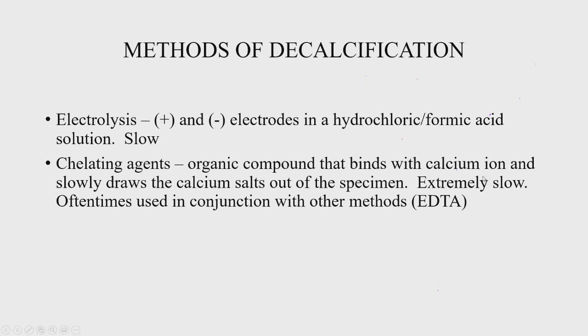The next is chelating agents, which are organic compounds that bind with the calcium ion and slowly draw the calcium and the calcium salts out of the specimen, once again into the solution.